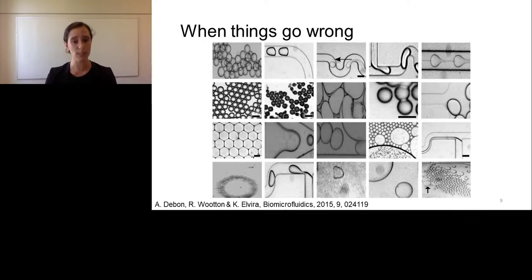So what we did in this research was say, okay, droplets are really important, and they have the potential to really help us do science and chemistry and biology that we really couldn't do in any other way, and there's some fantastic science out there. But realistically, we know that they don't work so well in the lab, and we have issues with this. So what I did is I got a microfluidic device, a very, very simple one, very similar to the one that I showed earlier on, and I made a lot of different types of droplets with lots of different types of oil phases. The water phase was always water, and then I added what we call a surfactant, which is effectively a stabilizing molecule.